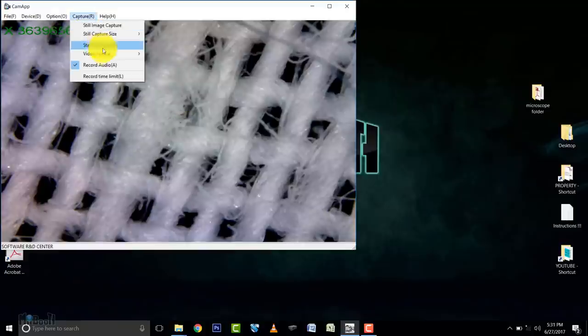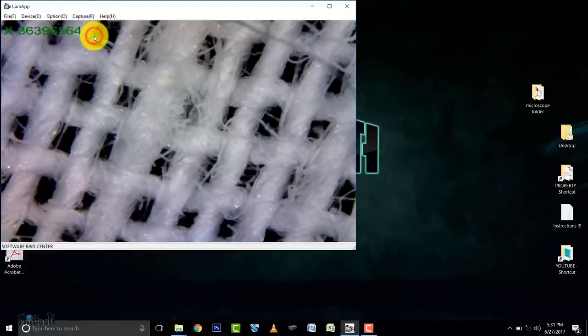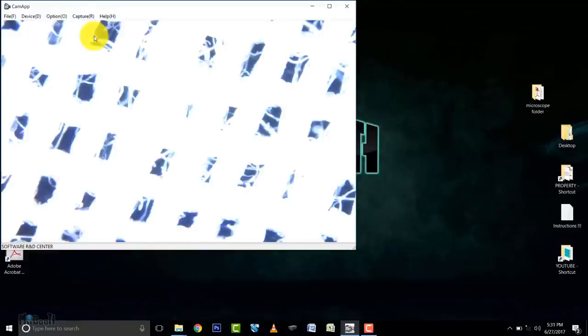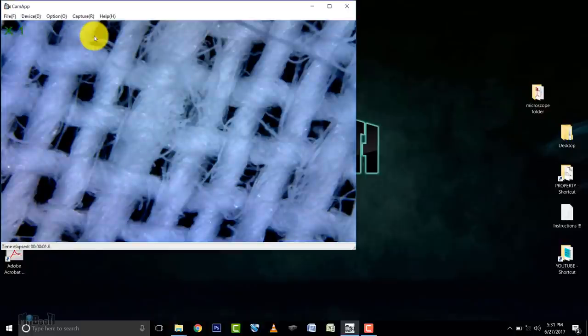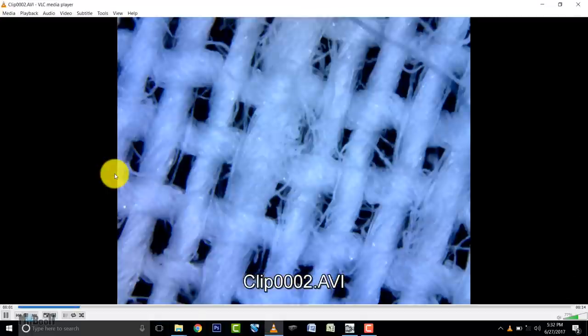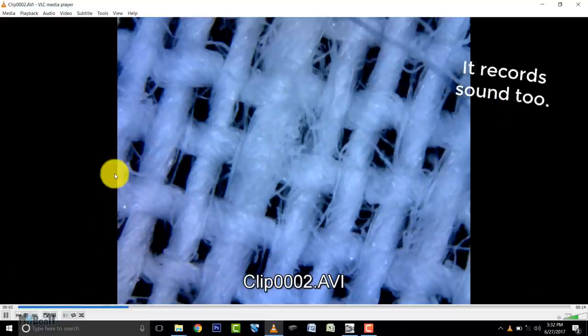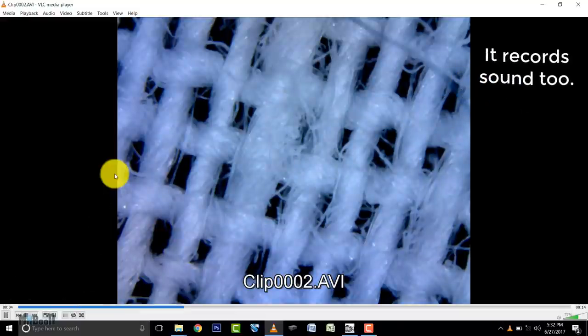If you go to the capture tab and press start capture, this will start recording a video, and you can do the same again to stop recording it. The output video is 1280 by 960 pixels default at 30 frames per second.